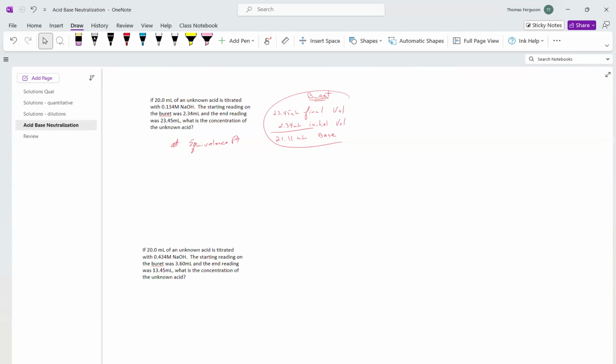So what we're going to do is go drop, drop, drop, drop from our burette into the acid and indicator, and it's going to turn light pink. And I stress that because if you go too far, it turns into Barbie pink. Really cool looking color, but you've gone over. You have to go until it just barely turns pink.